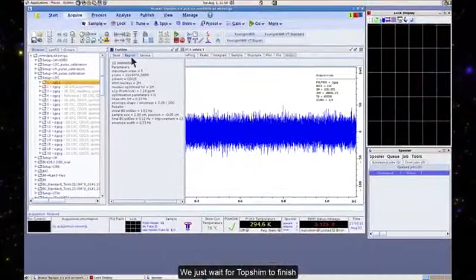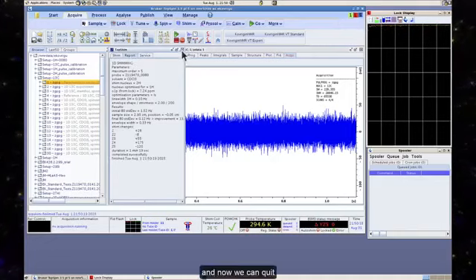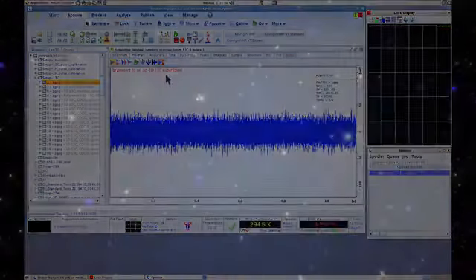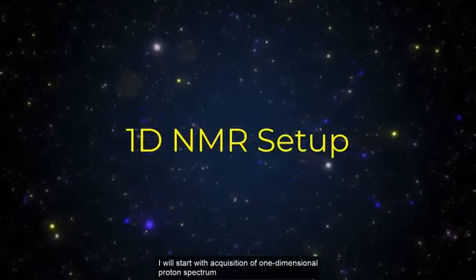Plot windows, for displaying spectra and FIDs. Parameter panel, where all acquisition, ACQUs, and processing, PROCs, parameters are set and viewed. Core functions, 1. Acquisition control, all commands for locking, shimming, setting up experiments, and acquiring data are executed here.